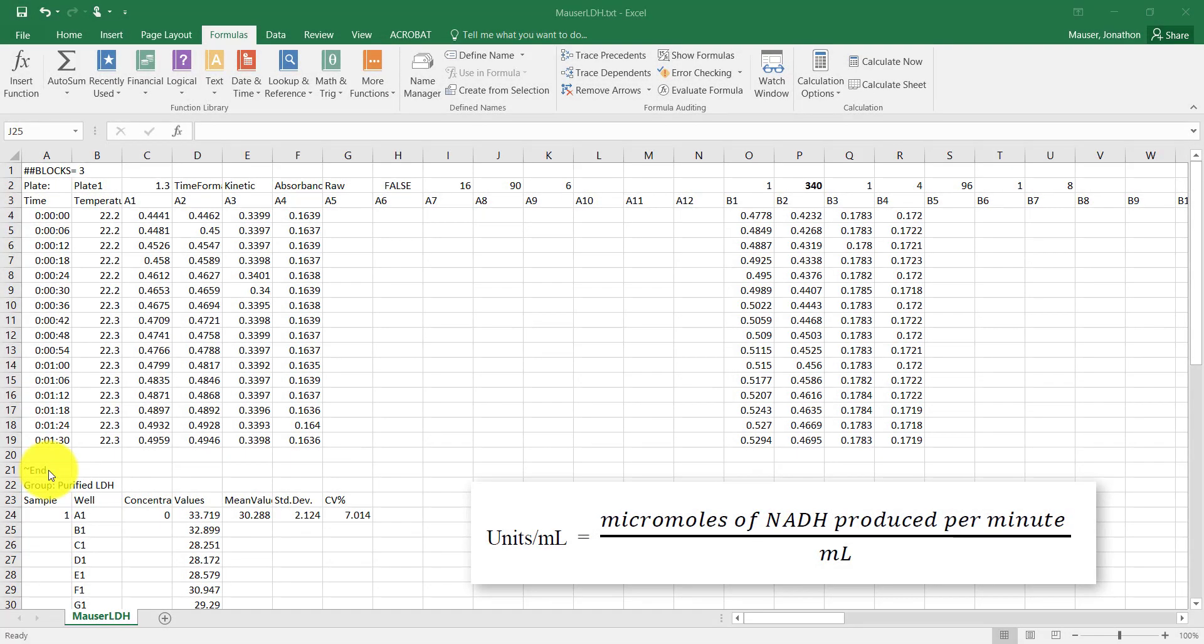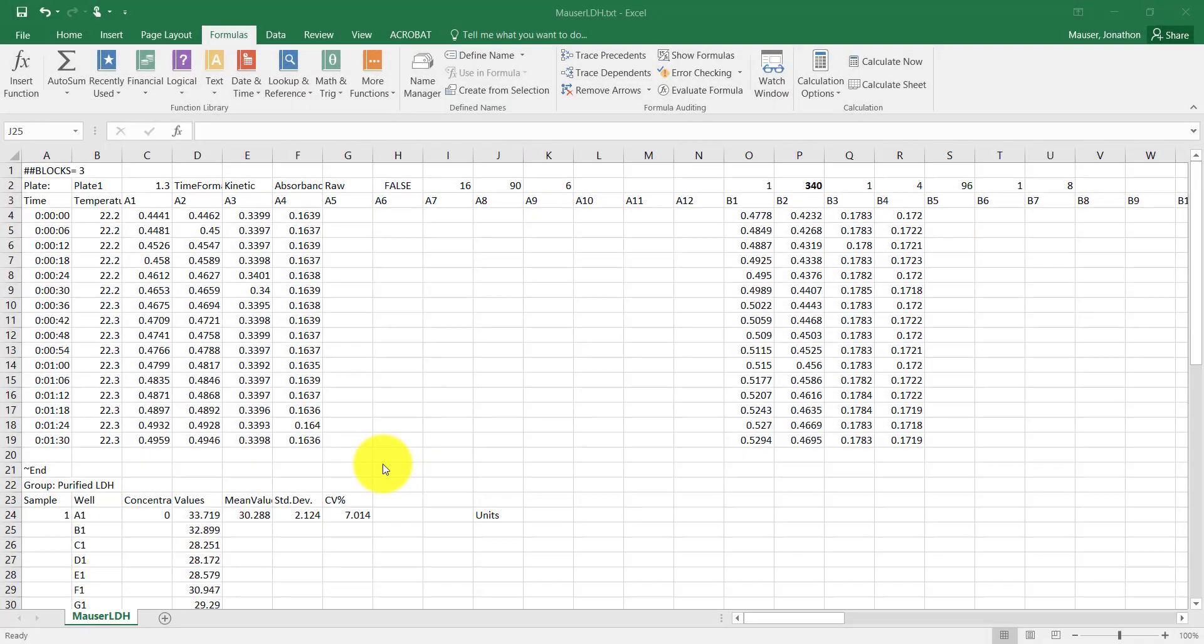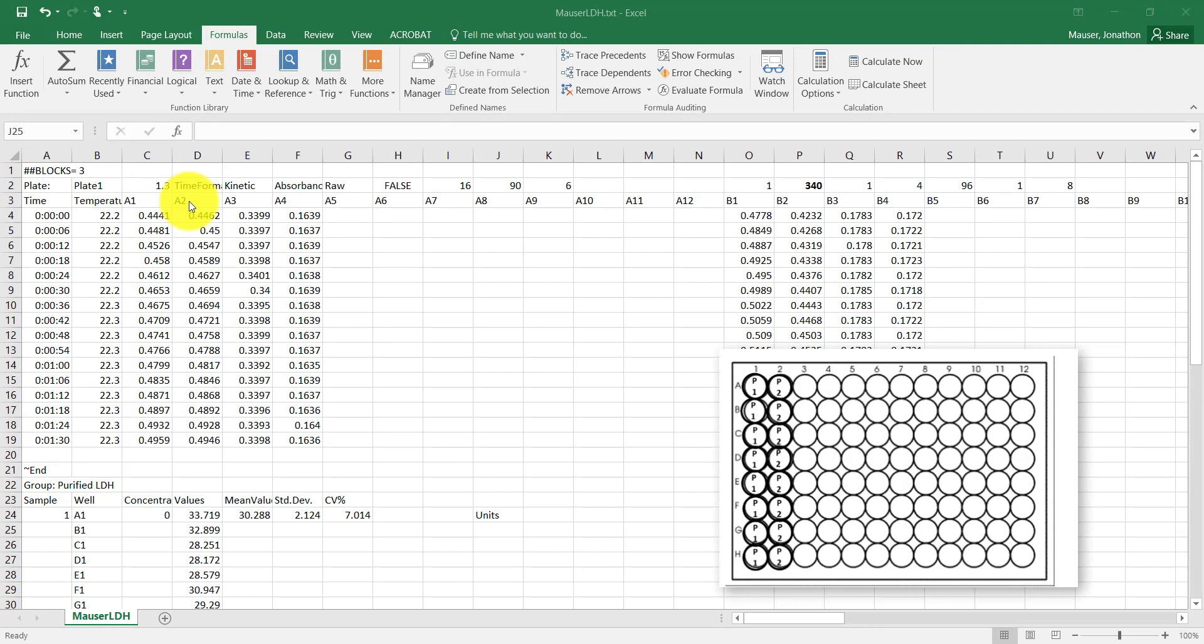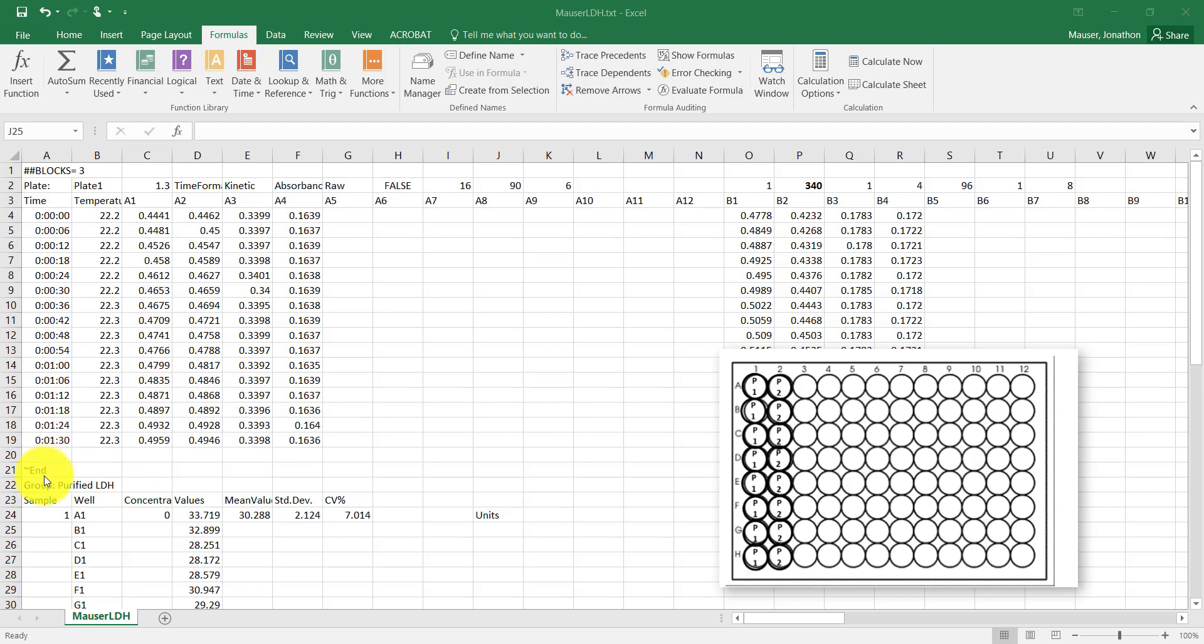Here's the raw data coming out, and for this experiment I looked at only columns 1 and 2 with purified LDH. This is very similar to what you see when you're doing purified LDH as the first step of this protocol as your practice.